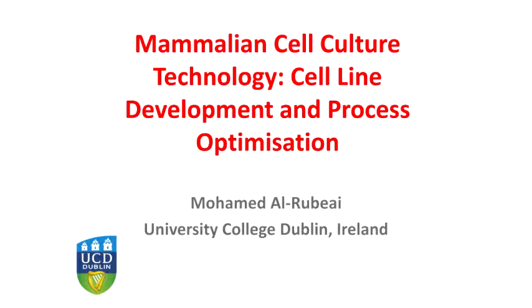And as you see here, my talk has changed now. The title is Mammalian Cell Culture Technology, Cell Line Development and Process Optimization.